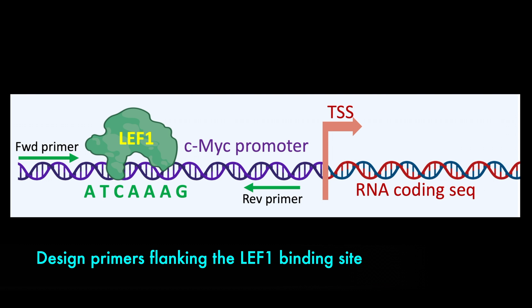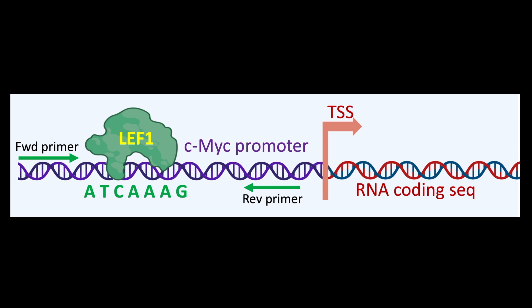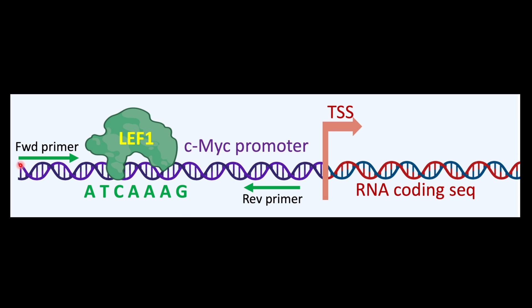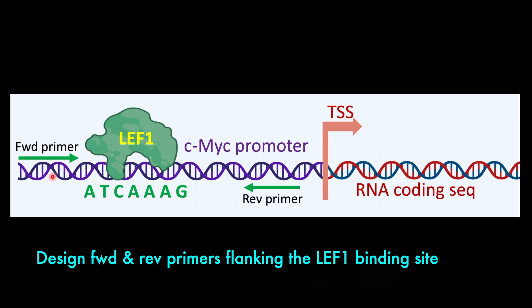In this tutorial, we will learn to design primers for chromatin immunoprecipitation that flanks a specific sequence in the promoter. The example here shows LEF1 transcription factor binds to the promoter of CMYC at a specific sequence ATCAAG. We will design the forward and reverse primer that flanks the specific sequence where LEF1 occupies at the CMYC promoter.